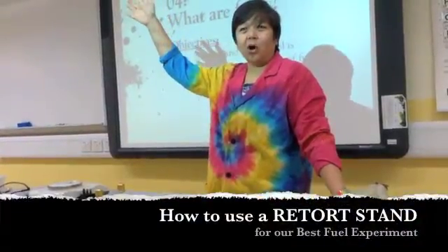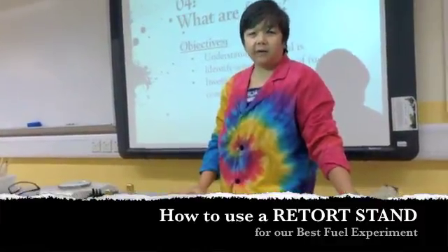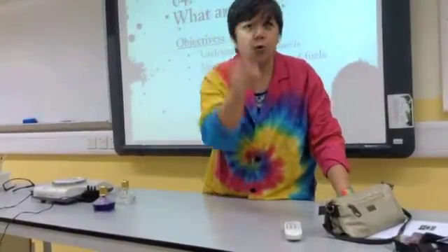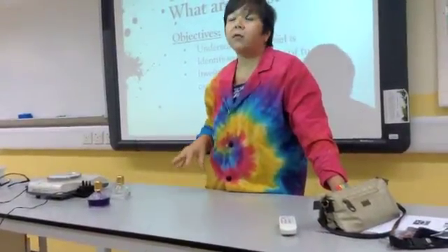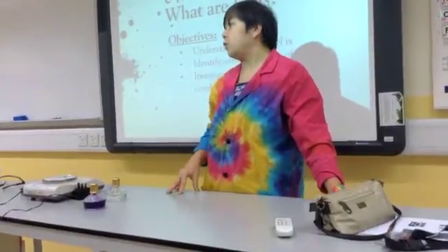Welcome to the 7D tutorial on how to use a retort stand for our best fuel experiment on Monday. The reason I'm doing this is so that you can watch this at home so that on Monday we do not have to spend a lot of time teaching you how to set up a retort stand.